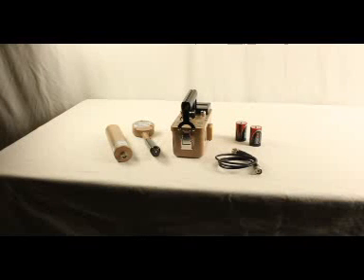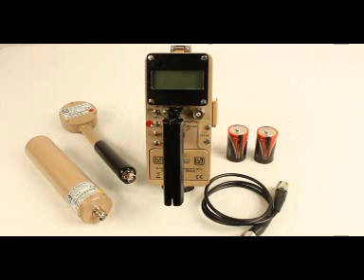The Ludlum 2241-2RK is used for detecting alpha, beta, and gamma radiation. It is used for radiation area surveys and contamination surveys. At the end of this video, you will be able to properly use the Ludlum 2241-2RK.